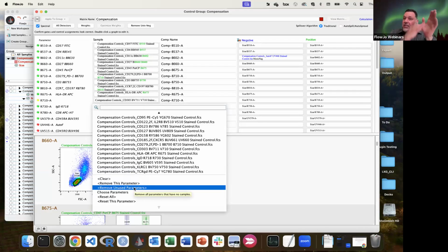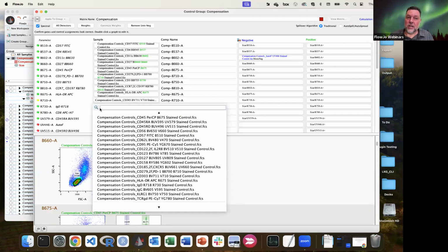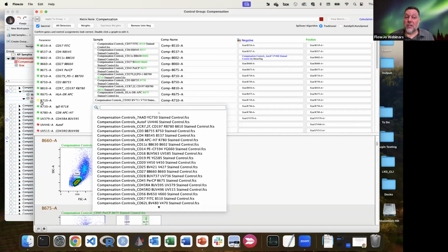Again, we're doing antigens times all detectors because we're using spectral, right? I'm using all detectors for this calculation. But what I've found is it's easier to go one by one, evaluate, do I have a control here? Here's another one, R710. This is a BV711 fluorochrome that the author of this data and panel decided should be in the violet, but it's assigned to a red.